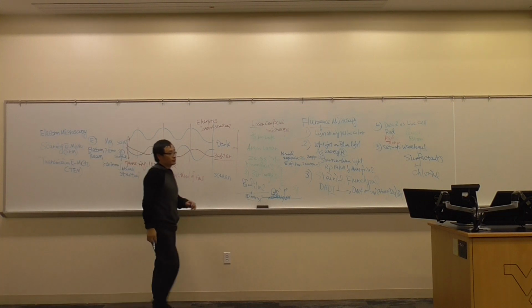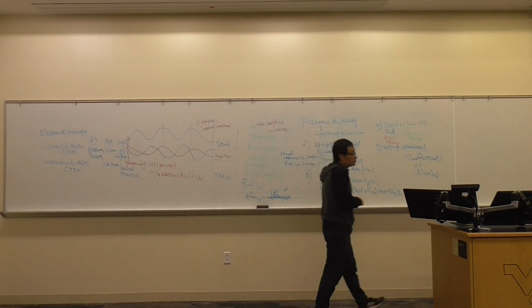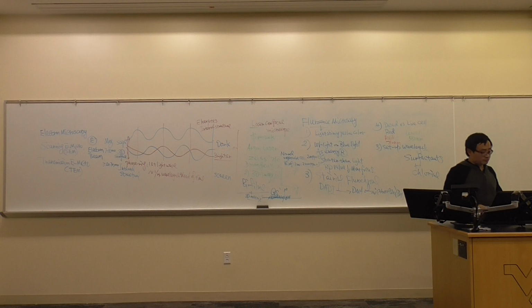This is a major difference. So we gave you some examples: transmission electron microscope and scanning. You see the basic structure there. You see the internal structure is more obvious for the transmission electron microscope. And for the scanning electron microscope, you can see it is most likely a 3D image of the surface.